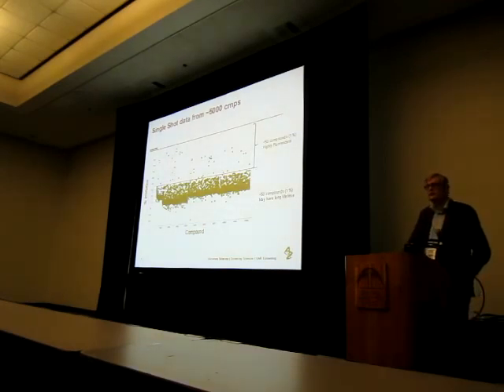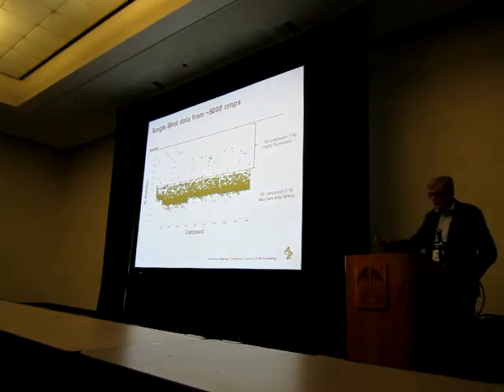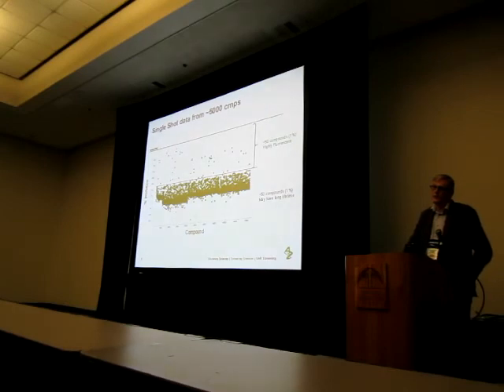We went back and looked at the fluorescence intensity figures for the compounds that fell into that upper category, and these are absolutely highly fluorescent compounds. The 50 or so that fell below the minimum cutoff, when you go back and check through, the data analysis suggests that these 50 compounds may have long or extended lifetimes. We could probably have cleaned this up a little bit if we'd changed the parameters around some of the additional analysis tools that are available within the software.